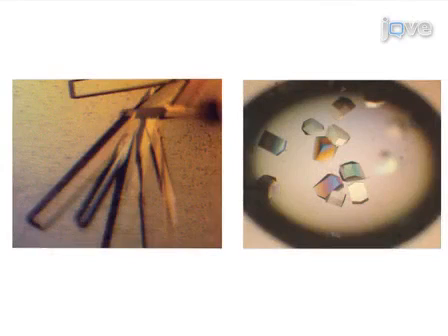Hi, I'm Oshet Esau from the laboratory of Professor Yerga Modis in the Department of Molecular Biophysics and Biochemistry at Yale University. Today we'll show you a procedure for the crystallization of purified protein. We use this procedure in our lab to study the structural basis of viral infection. So let's get started and grow some crystals.